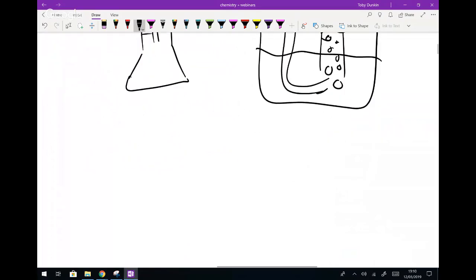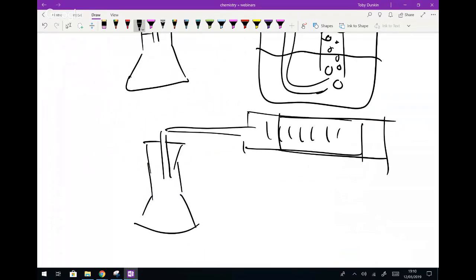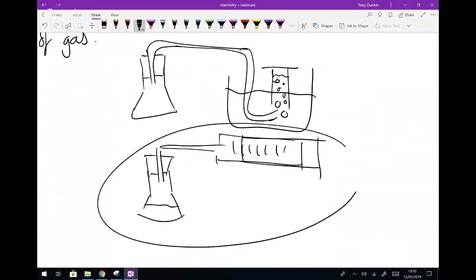And the gas syringe diagrams are again very similar. Conical flask, cork, delivery tube, but this time we have our gas syringe with our scales. It's rather an odd piece of equipment to draw, because you must show your scale. So there's our gas syringe, our 2 ways of collecting. Just to let you know that the gas syringe is always better. This is the ideal method for collecting a gas.